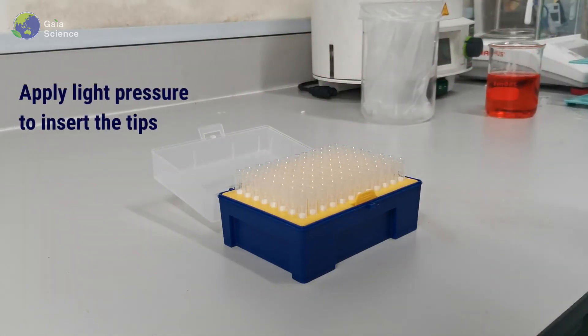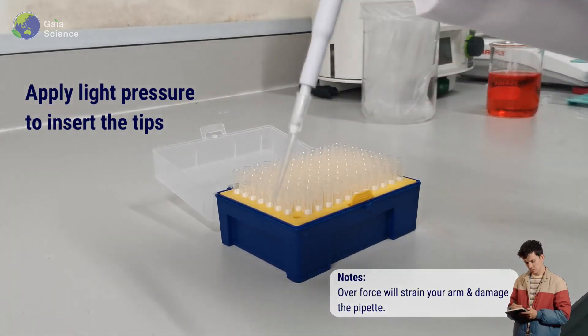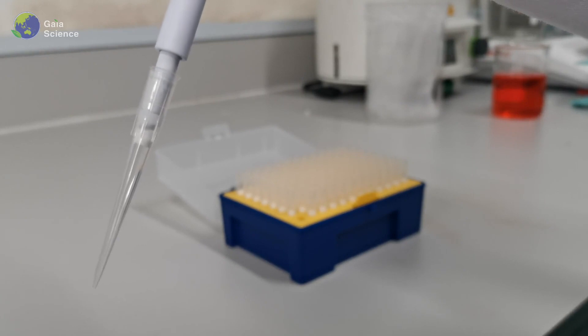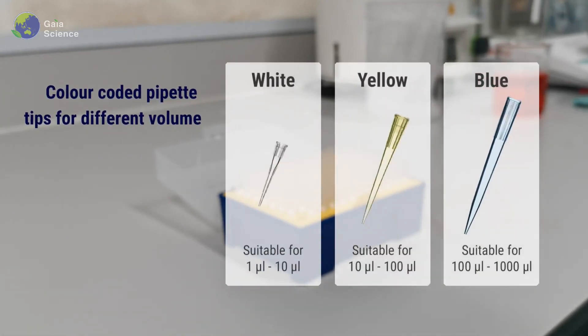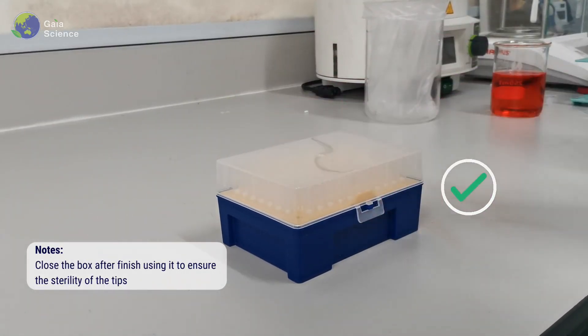Apply light pressure to insert the tips. Note that overforce will strain your arm and damage the pipet. Each tip for a different volume is normally color-coded for easier identification. Close the box after finishing using it to ensure the sterility of the tips.